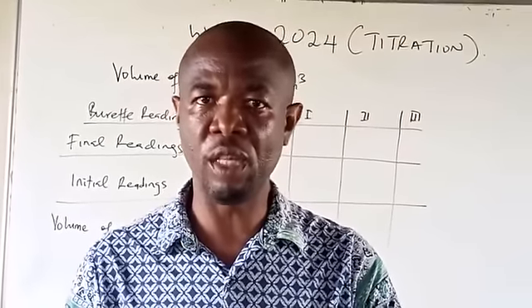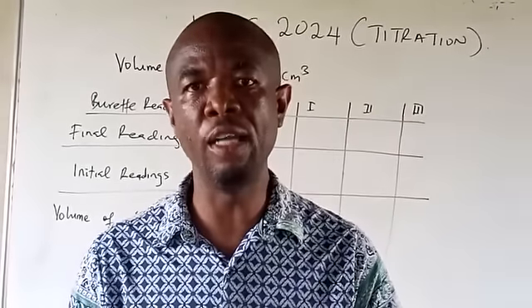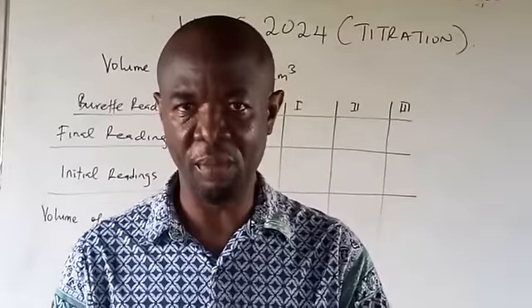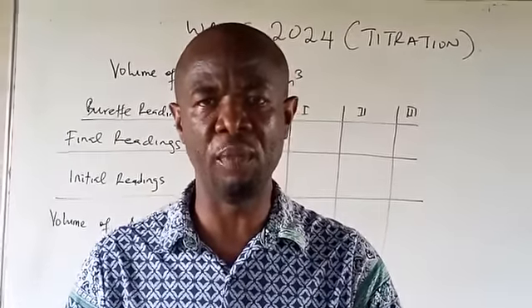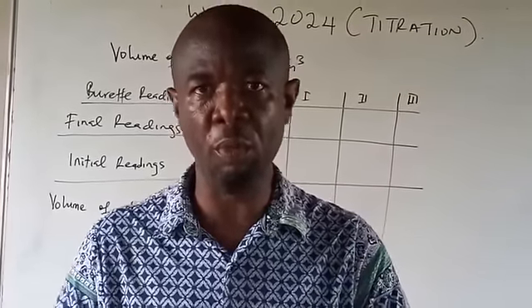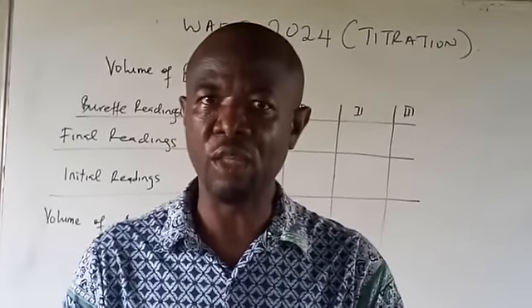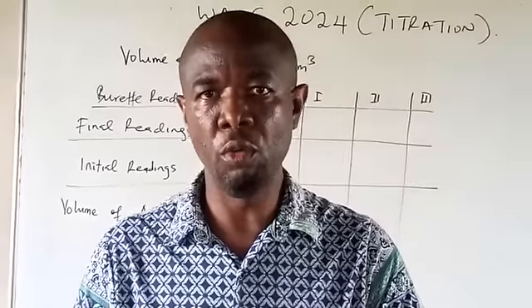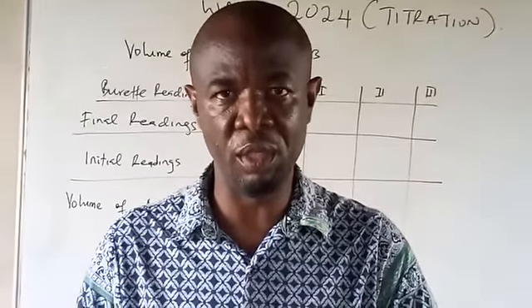WAEC is the West African Examination Council, meant for students in SS3 or high school 3, people who are about graduating from secondary school. The certificate examination is more like the SSCE, Senior School Certificate Examination, A level, or the London Cambridge GCE examination. So you can compare WAEC to the SAT or the Cambridge examination, which is taken in the UK or abroad. They run similar syllabuses. Today we're going to start with the titration experiment.